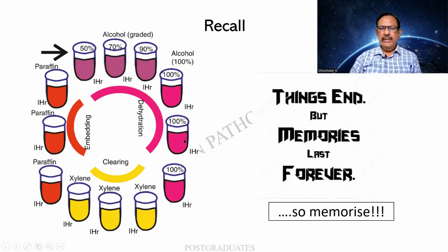Now, many things come in, but memories last forever. So what we should do is memorize. Memorize the various steps and the artifacts that can be occurring along with them.